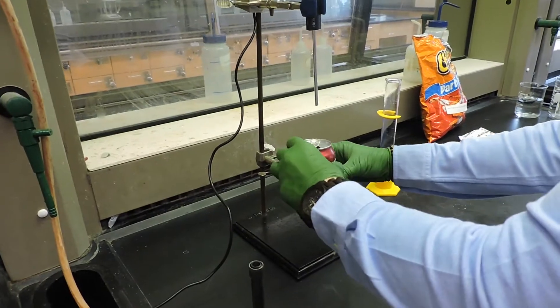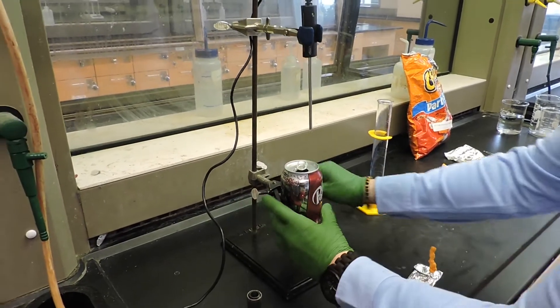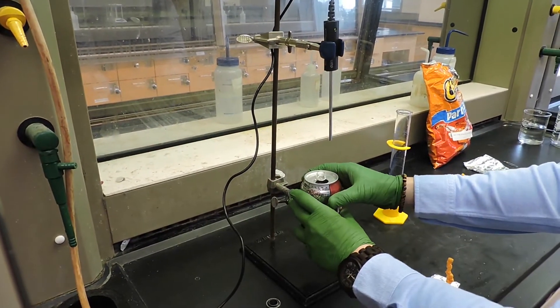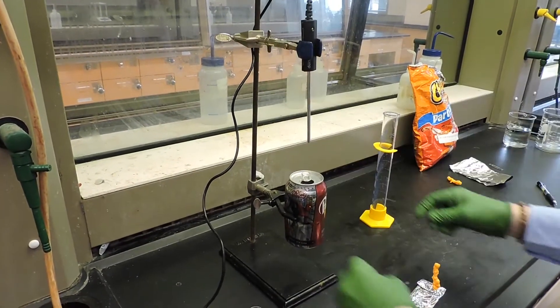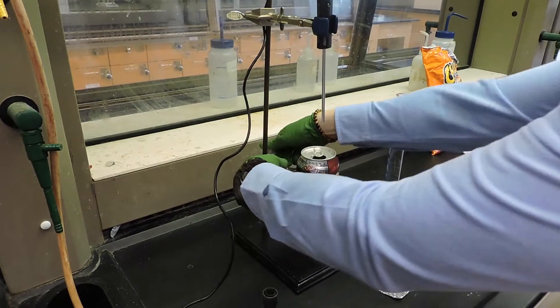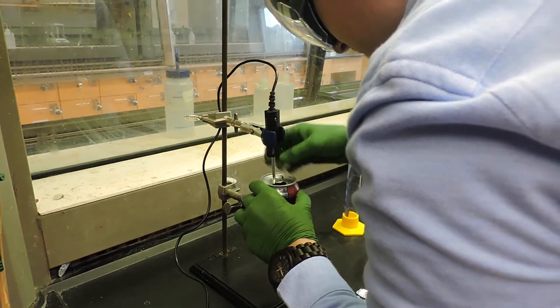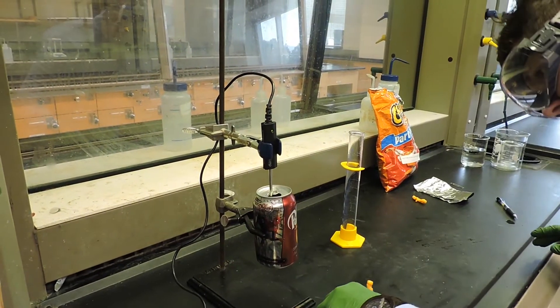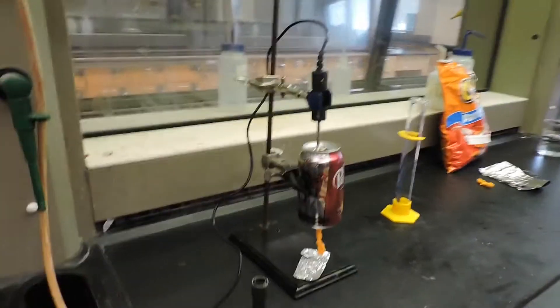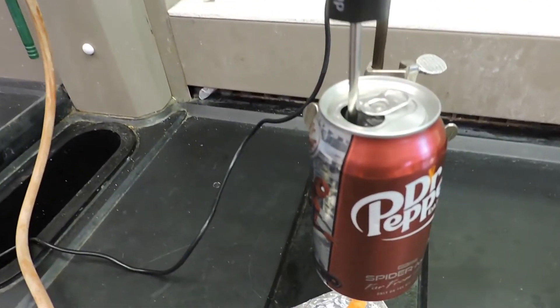You will mount the can onto a clamp which is attached to a ring stand. There's also a temperature probe mounted onto the ring stand, and that temperature probe will go inside of the can so that it is suspended in the water. You'll also place the food paper clip setup underneath the can so that the bottom is about 2-3 centimeters above the top of the food. The temperature probe is inside of the can.